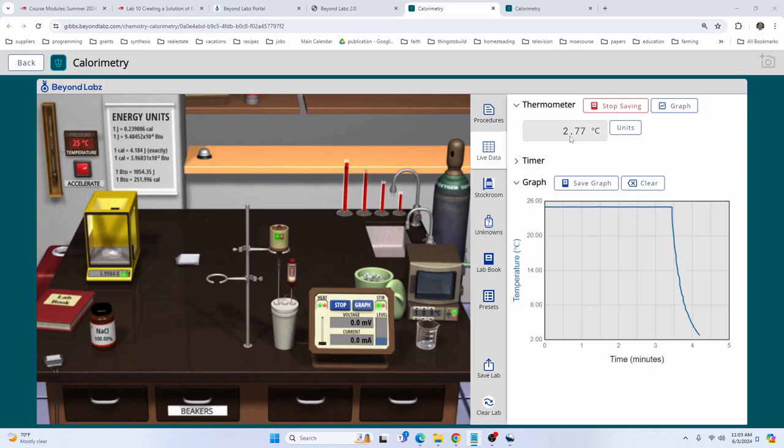Pure water has a freezing point of 0, and when you have both phases, liquid and solid phases of water, the temperature of that ice water is 0 degrees C, and so it will equilibrate, as we expect, to 0 degrees C. And we can see that we're steadily approaching 0. We want to wait until it reaches 0 before we proceed with the next step.